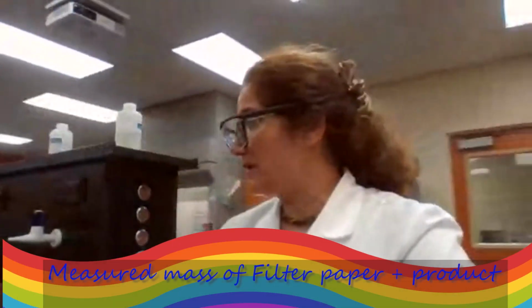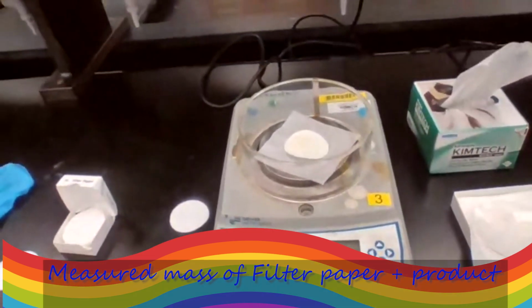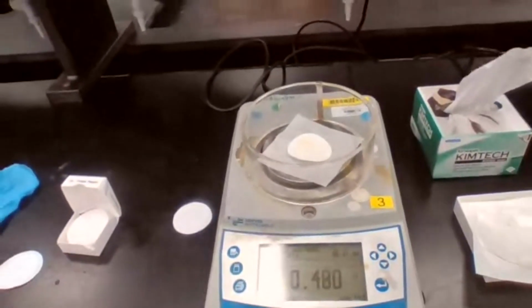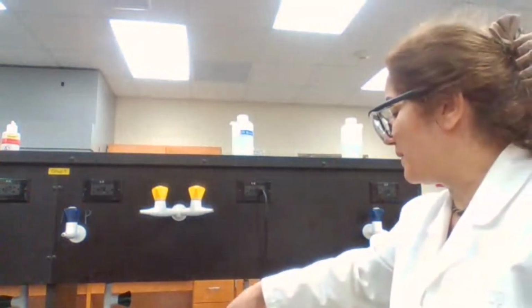Okay. 5 minutes. Gonna get the mass for the product. Record the mass for product. You got it? 0.479. That was the number. 75. Okay. This is with the filter paper, exactly. Yes. With the filter paper.